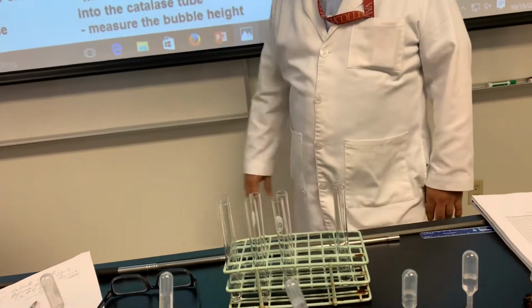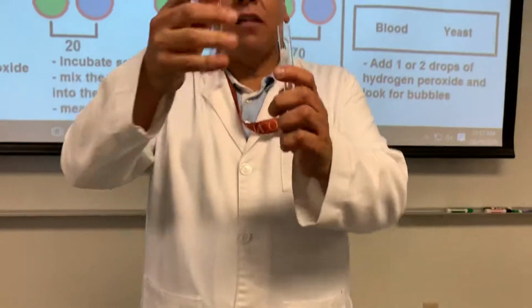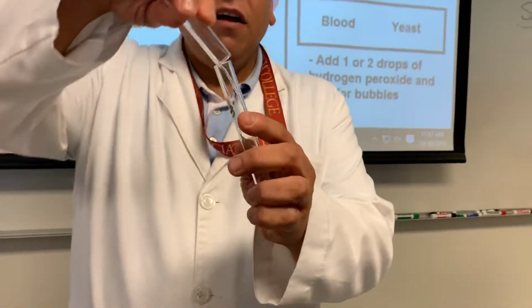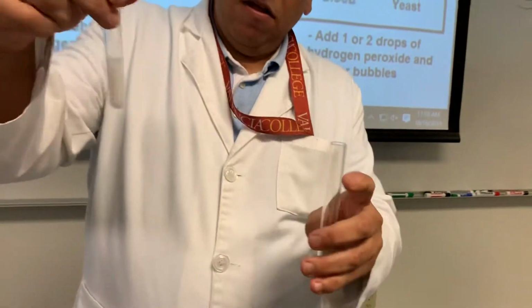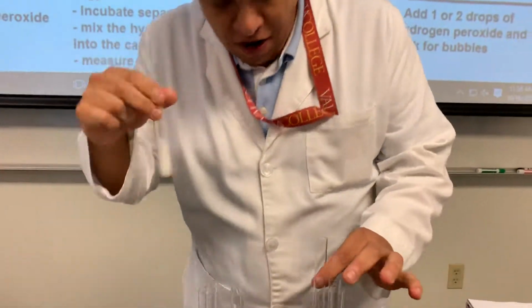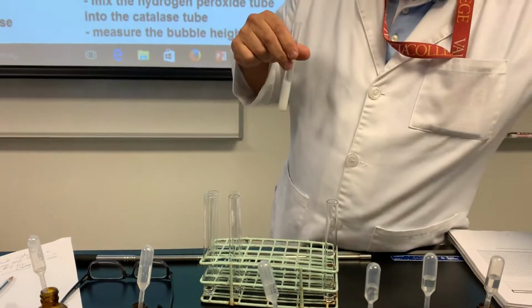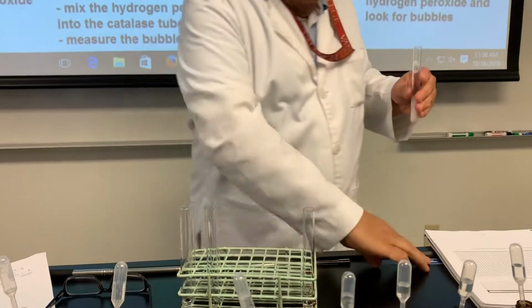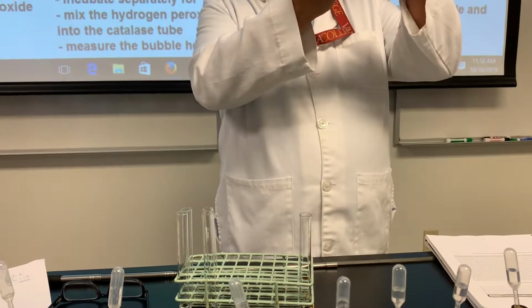20 degrees. Will it bubble or not? Yes, I think so. Oops. Wow. There you go. Thank you for that. All right, I'm going to measure this one here so you can get the data for that one. That is 55.